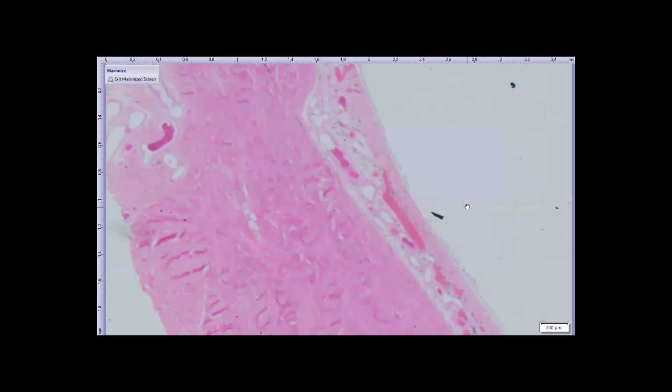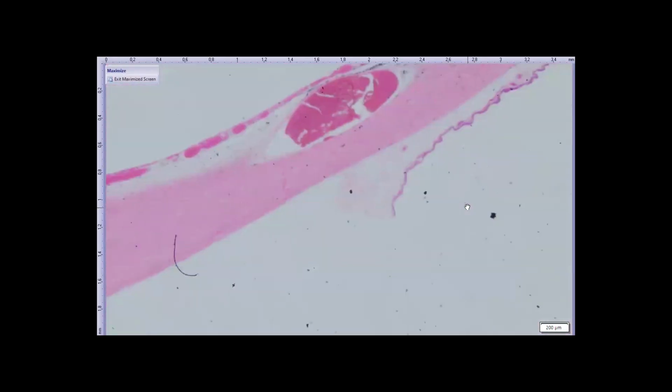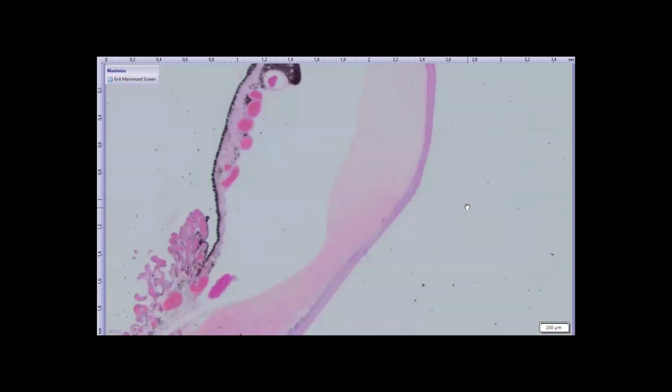It's very handy when dealing with eyeballs, because looking at the very low magnification is good. One time I was at a meeting where there was a microscope salesperson selling his microscope, and I wanted to show somebody something in a slide. So I did that. I put the slide down below and adjusted it, and the salesman came running over. He said, "No, no, no, that's not how you use a microscope." So I had to show him what I was doing. You mean I've been doing it wrong my whole career? Wow.